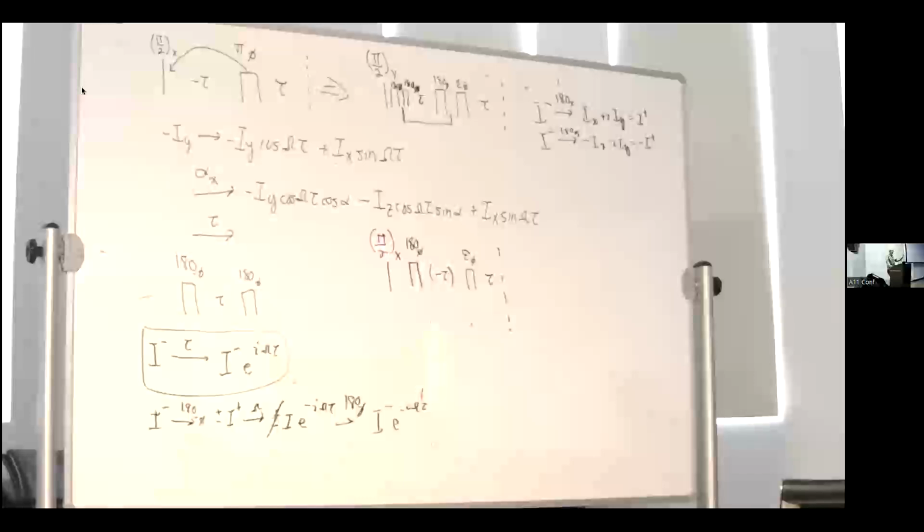So gradients can do the same thing, as we'll see, in one shot in cleaning up the imperfections from a 180. So now when you look in a pulse sequence, there may still be exorcycle on a few critical 180s, but mostly you just have gradients around the 180s, and the phase cycle is very short. And if you're going to 4D and 5D, you can hardly afford any phase cycling at all on 180s. You just rely almost completely on the gradients to clean them up. That's for next time too.